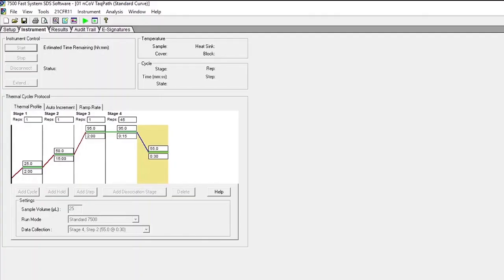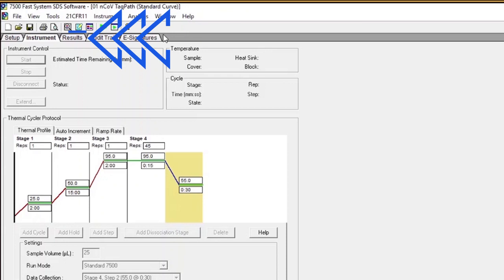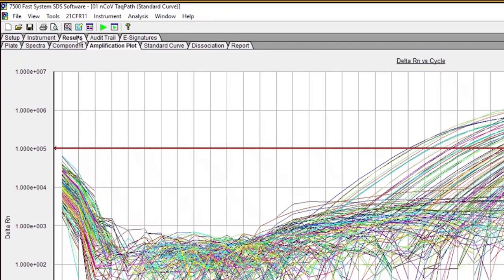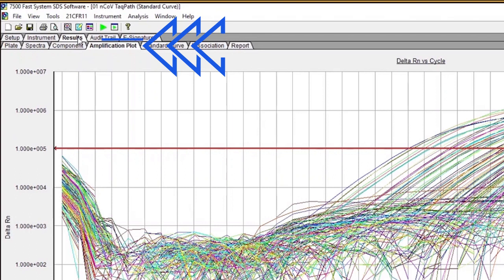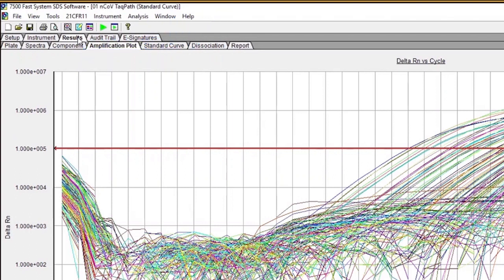Once the FLU SC2 multiplex assay run has completed, select the Results tab found in the upper left corner of the software. In the Results tab, select the Amplification Plot tab to view the raw data.